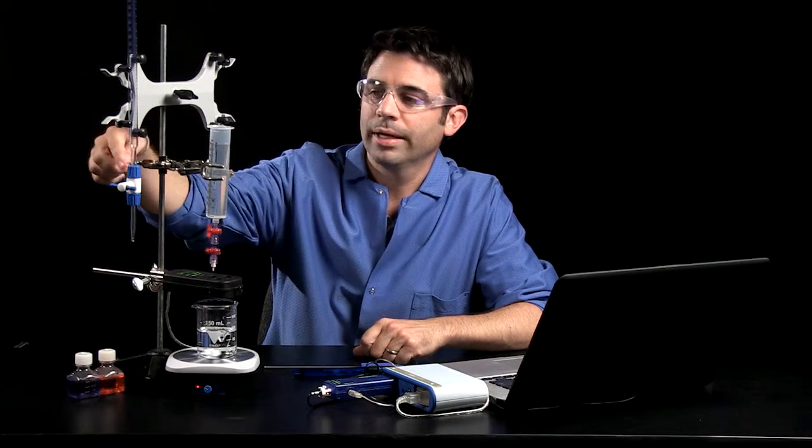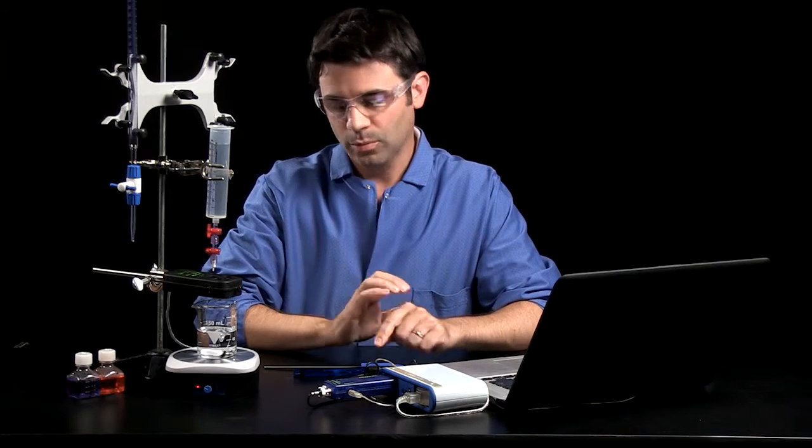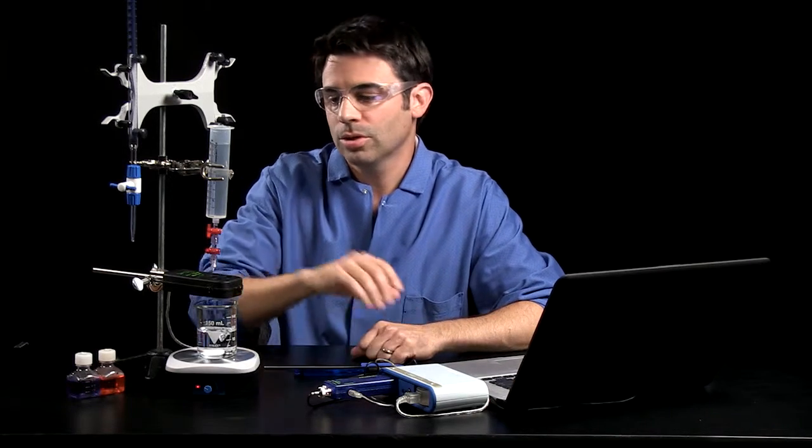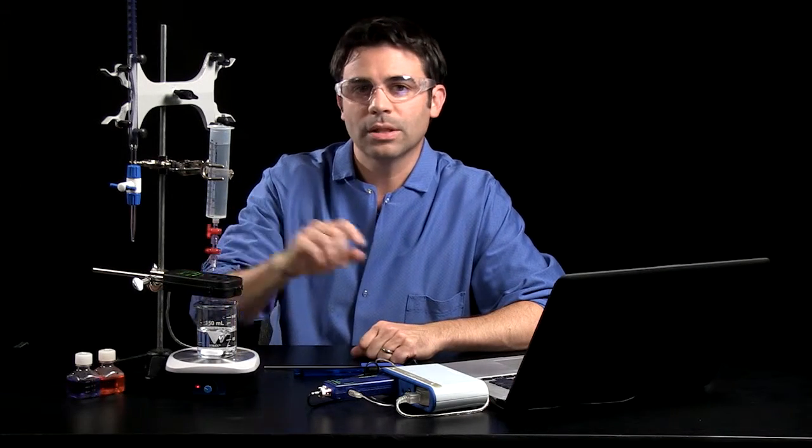Most titrations involve pH and a burette to monitor the volume of titrant added. In this case, we're going to do it a little differently. We're going to measure pH and temperature using our chemistry sensor, and we're going to use our drop counter and our drop dispenser to measure the volume of titrant added. So let's get this set up so we can see how it works.